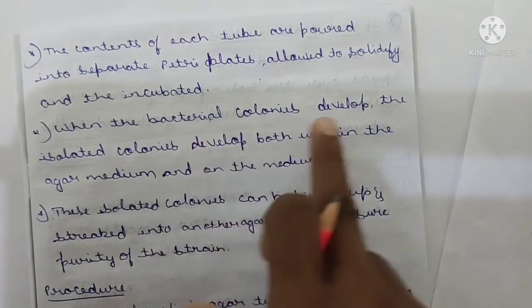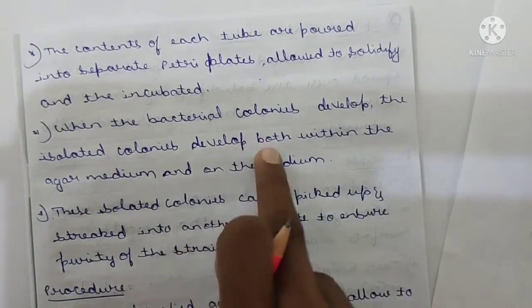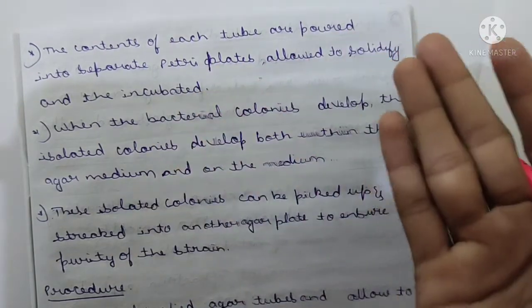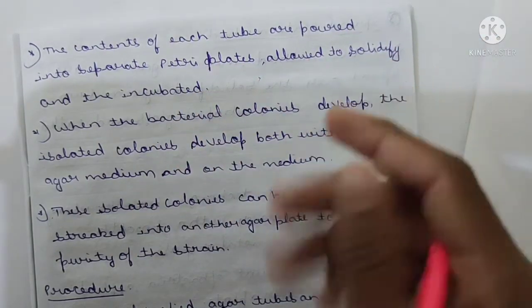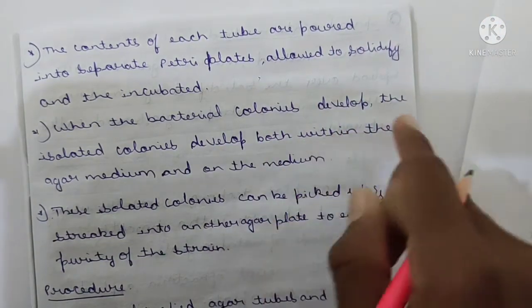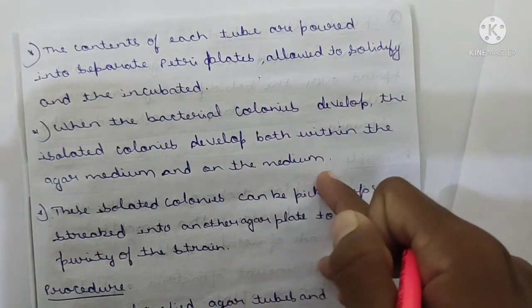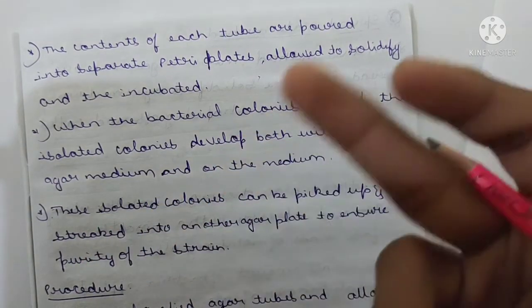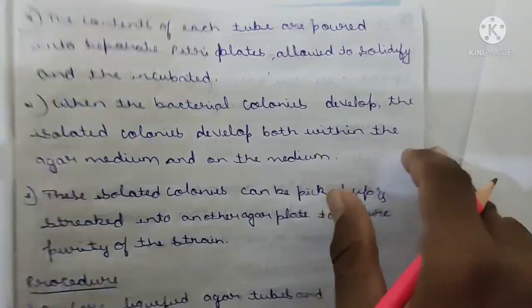When the bacterial colonies develop, isolated colonies develop both within the agar medium and on the surface of the plates.